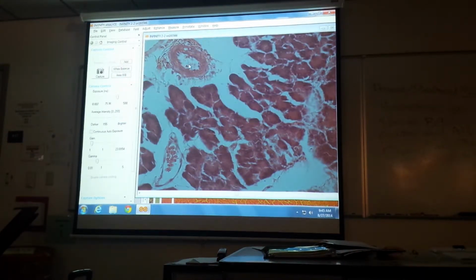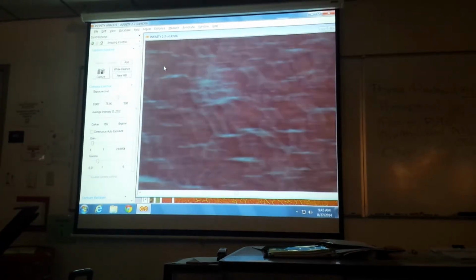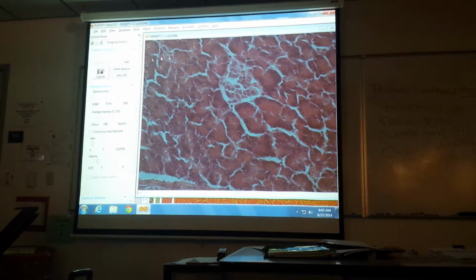If you see something with a lumen, is that what you're looking for? No. No. That's what you're looking for, that clump of cells. So I'll get a picture of that one for you. See if I can find another one. Well, we are pretty good.